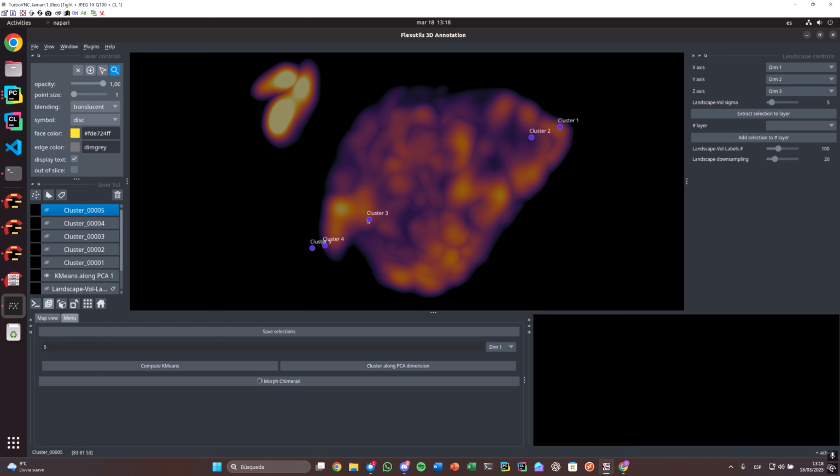But here I am asking to show points along the first principal component. Of course, UMAP and PCA are not compatible with one another, and that's why we are seeing that some points become very clustered here. Then we have no points here in this region in the middle. This is just because of the non-linearities of UMAP compared to PCA. But again, this is really computing the clusters in the first principal component.